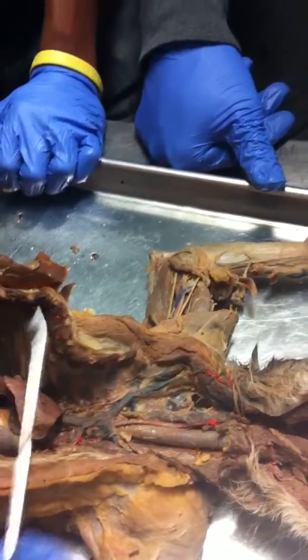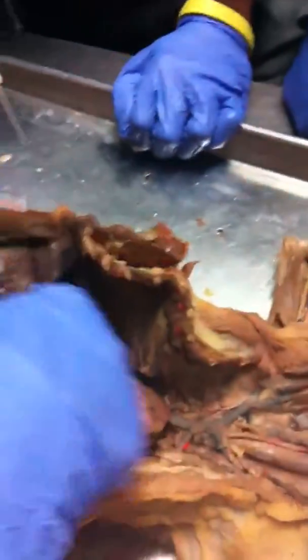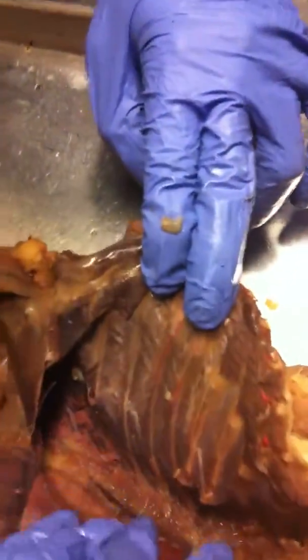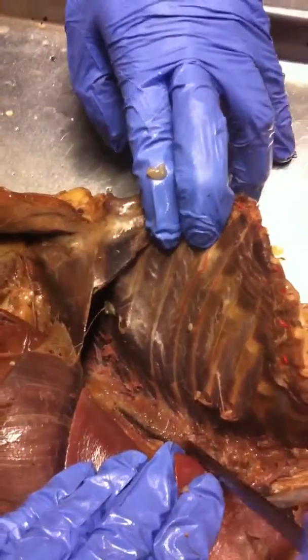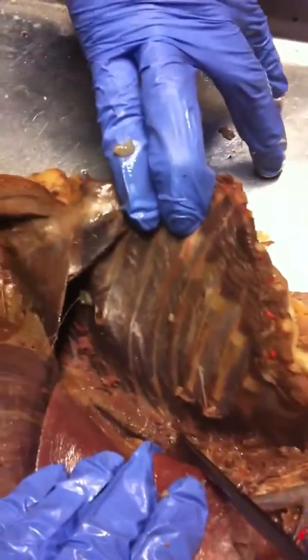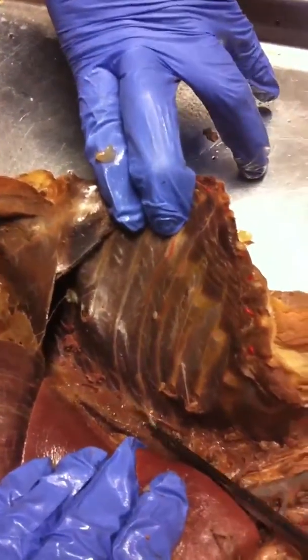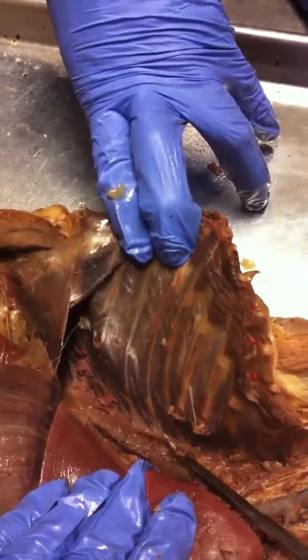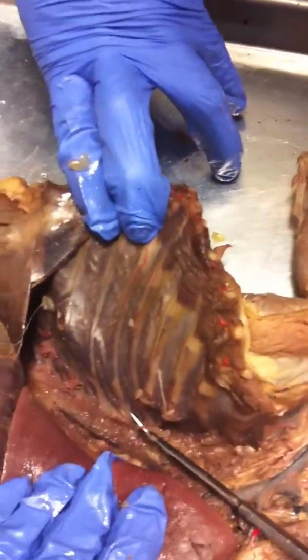All right, sympathetic chain. Sympathetic chain also, we cannot see on this cat very well, but you can kind of see right there is a little nerve. And that, yep, okay, there. That would be the sympathetic chain. Which one? The one I'm holding up right here.